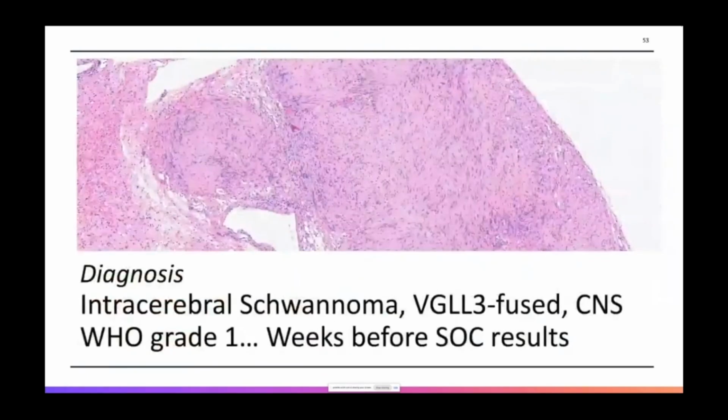So I've shown you that actually it is possible to do this, and we can run these classifications very easily, local to the patients. This was the correct diagnosis, and in this case, for various reasons, the standard of care was even slower than we would like, but it was confirmed to be the correct diagnosis.